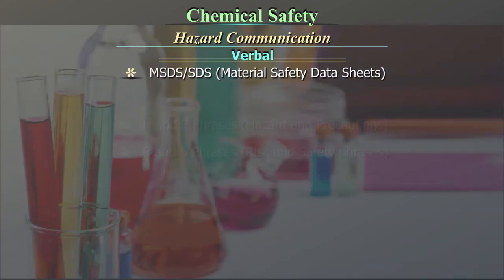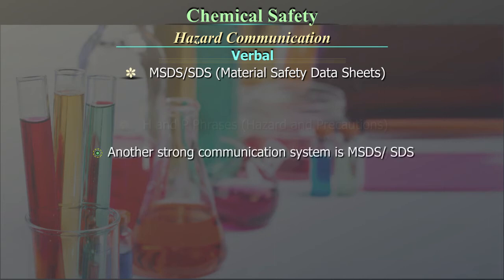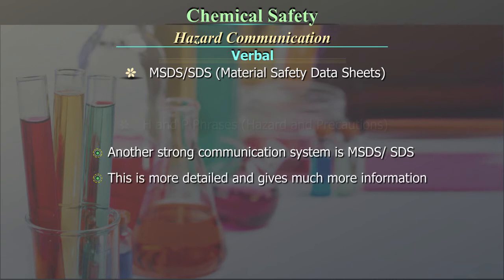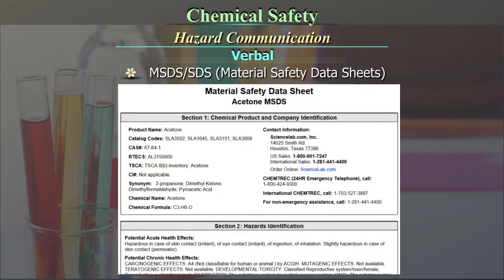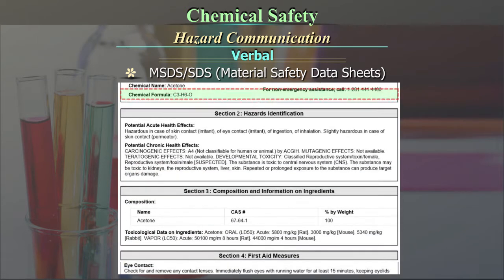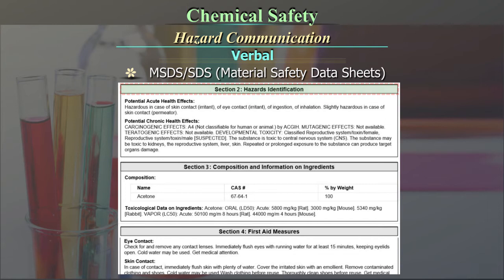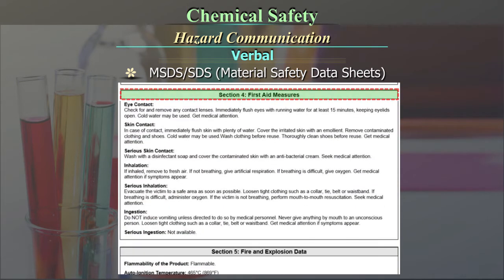MSDS or SDS — Material Safety Data Sheets. This is another strong communication system. It is more detailed and gives much more information. The following aspects are addressed through an MSDS: (1) Identification of the substance or mixture and of the company or undertaking; (2) Hazards identification; (3) Composition or information on the ingredients; (4) First aid measures.